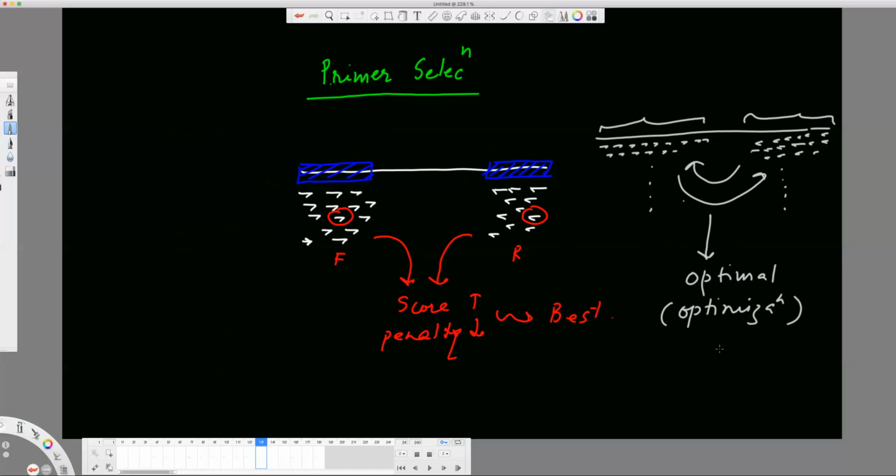There are a number of optimization algorithms, which include the genetic algorithm, simulated annealing, steepest descent, conjugate gradient, and so on. You can try any of those to find the optimal solution to your problem, if the search space for primers is increased dramatically and there is no real-time solution available.